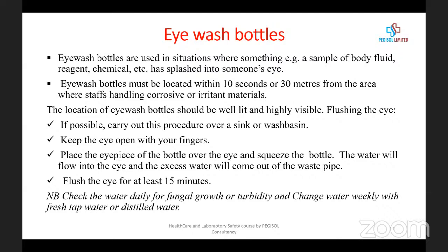The location of the eye wash should be well lit. These are eye wash bottles, what we call. You have this, it saves you a lot from splashes in the eyes. The eye is very important. We don't want you to be deformed. You don't want to get blind.